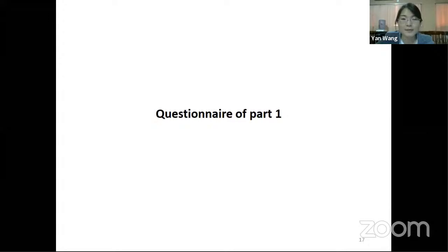And the number 2 question, which one is wrong? I think I should not design something like this. You may be a little bit confused. So preparative HPLC has a bigger column, right? This is fine. Preparative HPLC columns have bigger particles. Particles are also a little bigger, because analytical HPLC has a very delicate column with small size of particles.